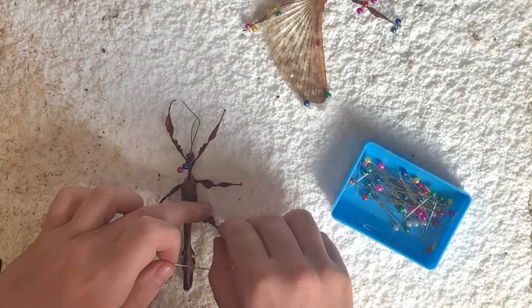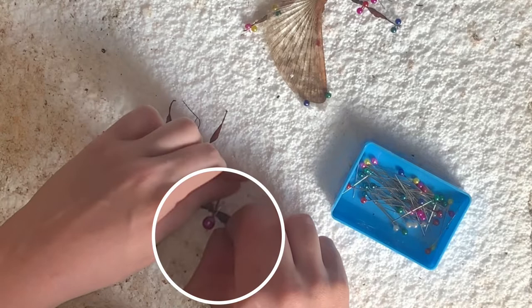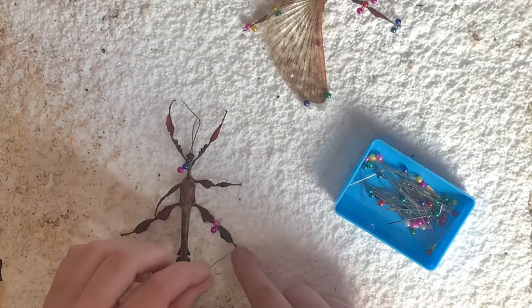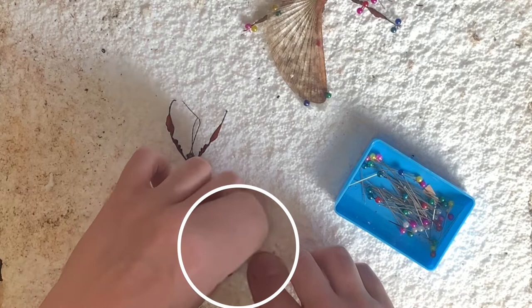Once the head is stable, carefully stretch out the hind legs and put a pin on each side of the femur and tibia joint, making sure they are crossed over the top of the leg. Because we will be spreading out the wings, the pins must be pushed all the way down to enable the wings to lay flat. Two more pins should then be crossed over the tarsals. Repeat this step for the remaining legs.